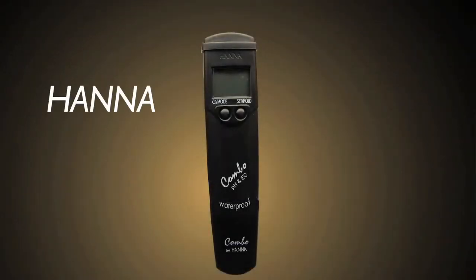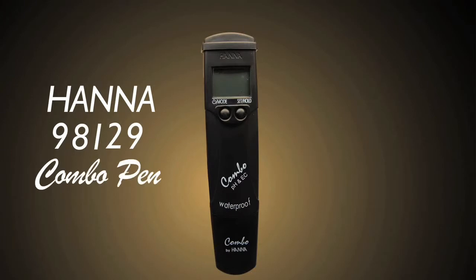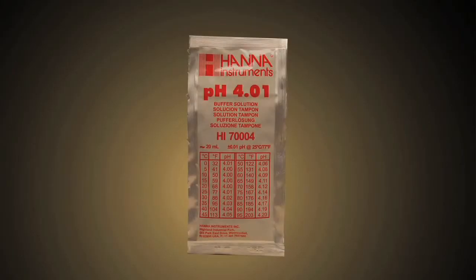We're going to calibrate the Hanna 98129 combo pen. If this is a new pen, you'll want to activate the pH electrode by soaking it in a 4.0 solution for at least an hour.